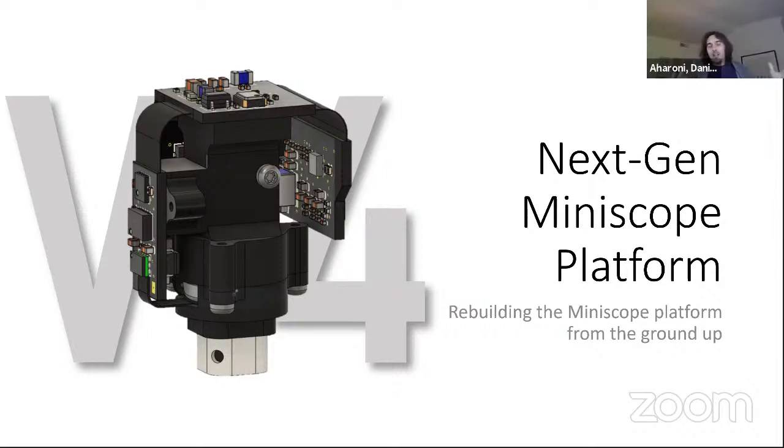Okay, so that's a rough overview of miniature microscopes. We're not the only ones that make open source miniature microscopes. There's quite a few with different capabilities. I think ours is, I'm sure, the most widely used miniature microscope in the world. We really try to support it as well, but many other people do the same.